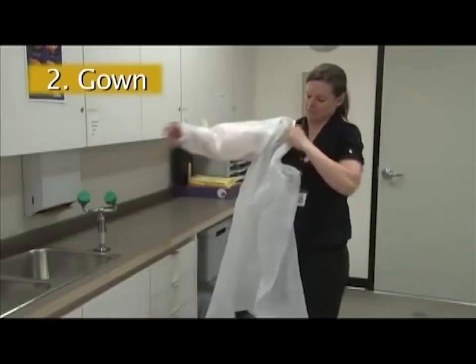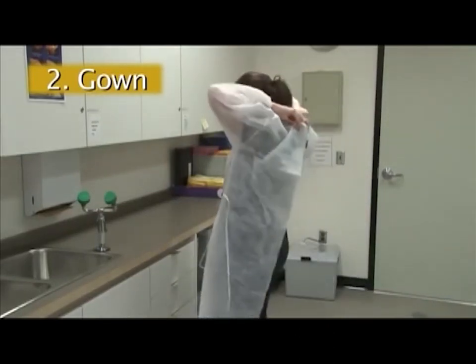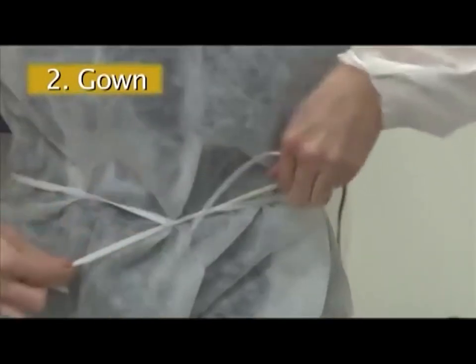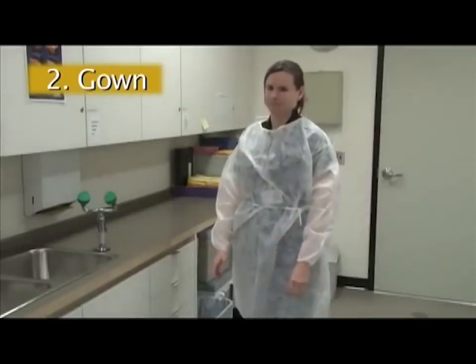The gown is to fully cover your torso from neck to knees, shoulders to wrists. Wrap it around the back and secure it with ties at the neck and at the waist. If the gown is too small, use two. The first ties in front, the second in back.